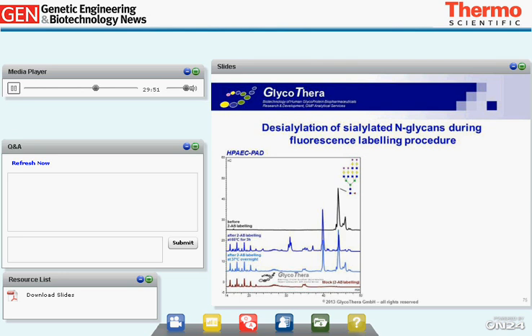The second profile from above is a profile of the tetrasialylated tetraantennary N-glycan after 2AB labeling at standard conditions. What we see is the remaining starting material without label, about 20%, and the 2AB labeled glycan structure, about 50%. Additionally, the 2AB labeled glycans missing 1 and 2 sialic acid residues were also detected, representing about 25% of total carbohydrate signals. Further signal peaks were assigned as a reduced starting material and the starting material lacking 1 sialic acid residue.